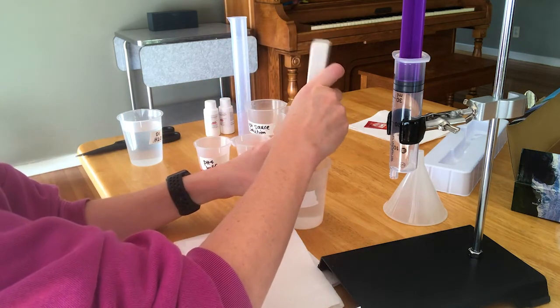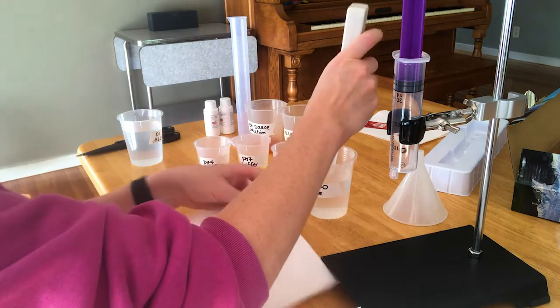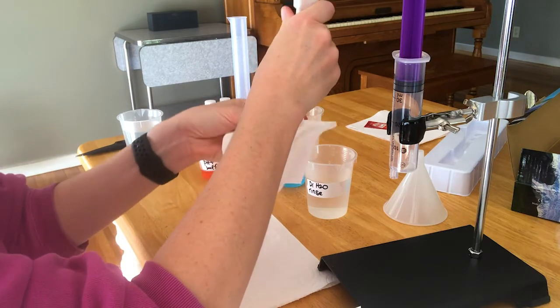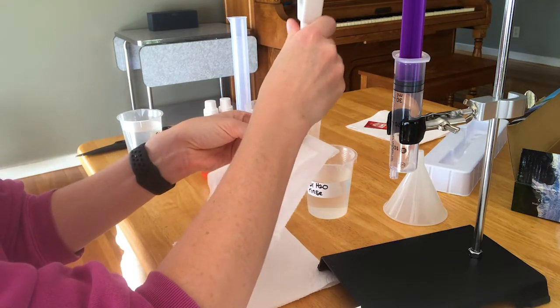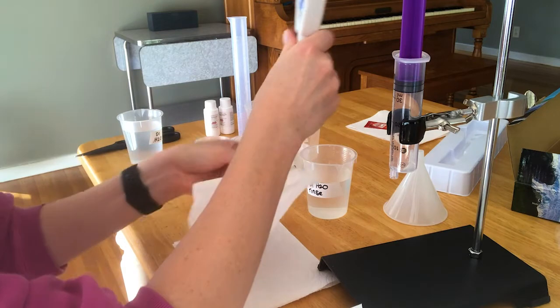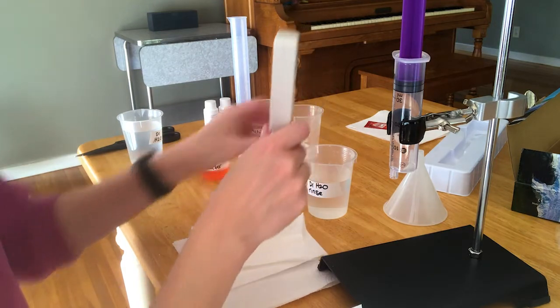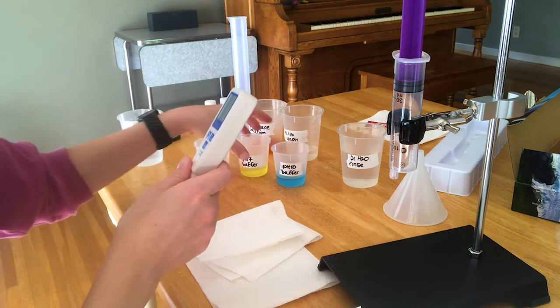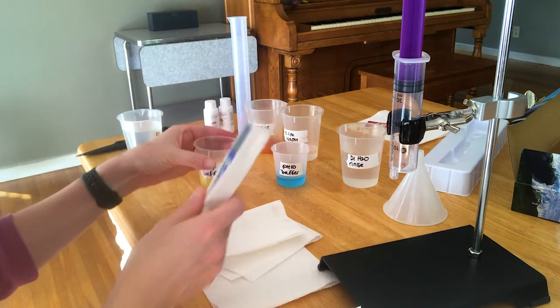Don't bang it against anything. When you rinse it, you want to wipe off the outside and then just carefully dab the bottom. Do not scrub it with the paper towel. This glass electrode is how this pH meter works, so we have to be careful with it.